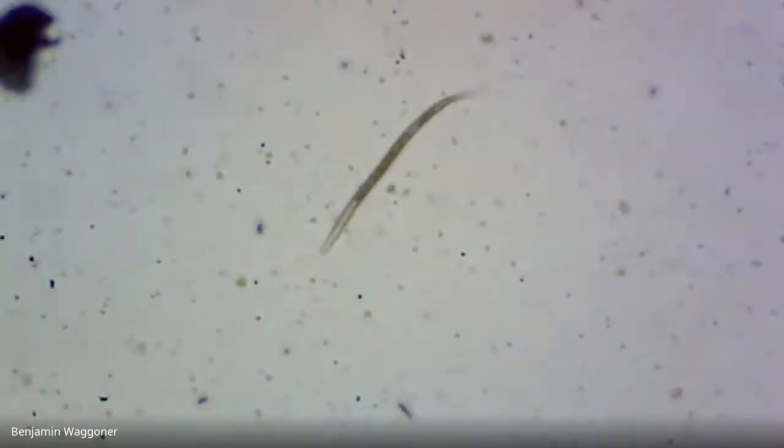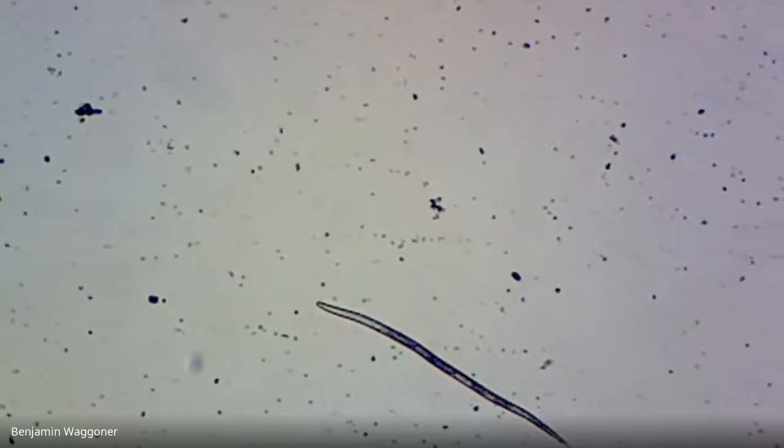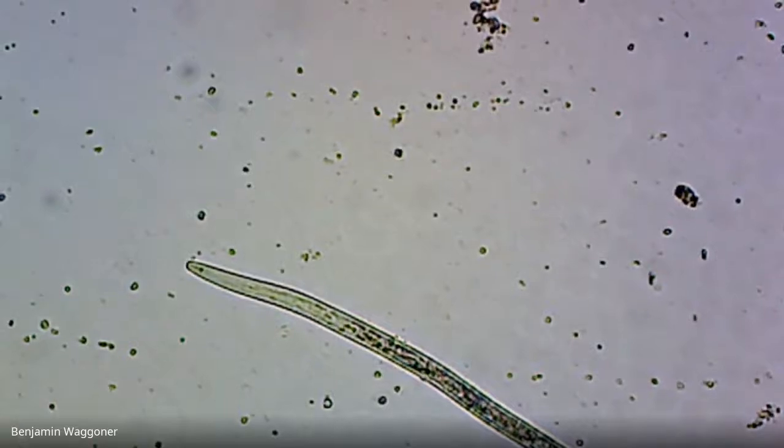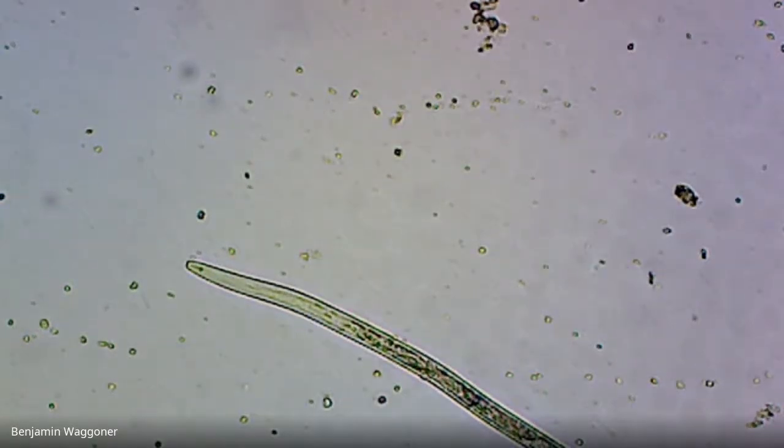And there was one down here. Take that back. That's not a nematode. That's a fiber. That's cloth or thread. So that's the one we were just looking at. And here's another one. And there's its head. And you can decide what it's got in its head.